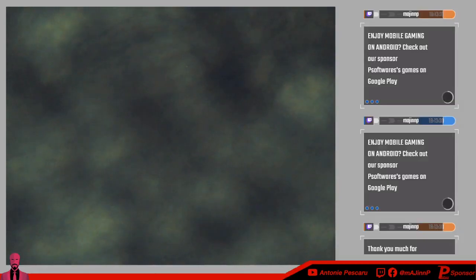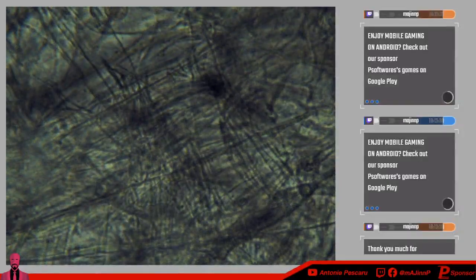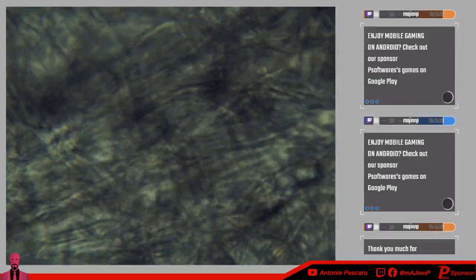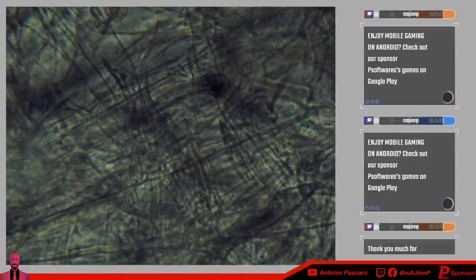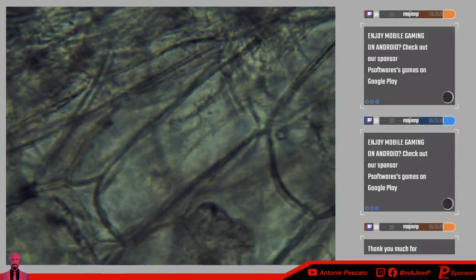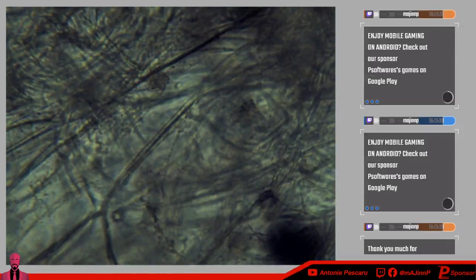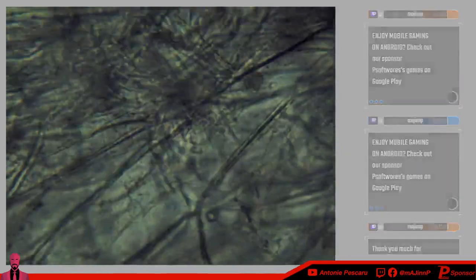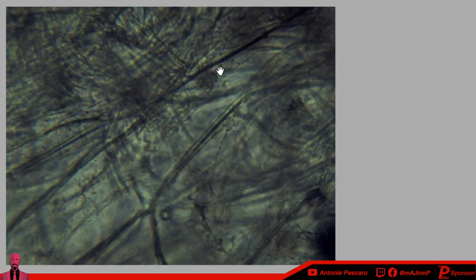As you can see, everything is blurry, and it looks really trippy. This looks incredibly trippy right now. I'm looking at a bunch of stuff, but not really. Oh, here's a few cells that you can make out. And if I'm not mistaken, this is either dust, water, or it's actually a nucleus.